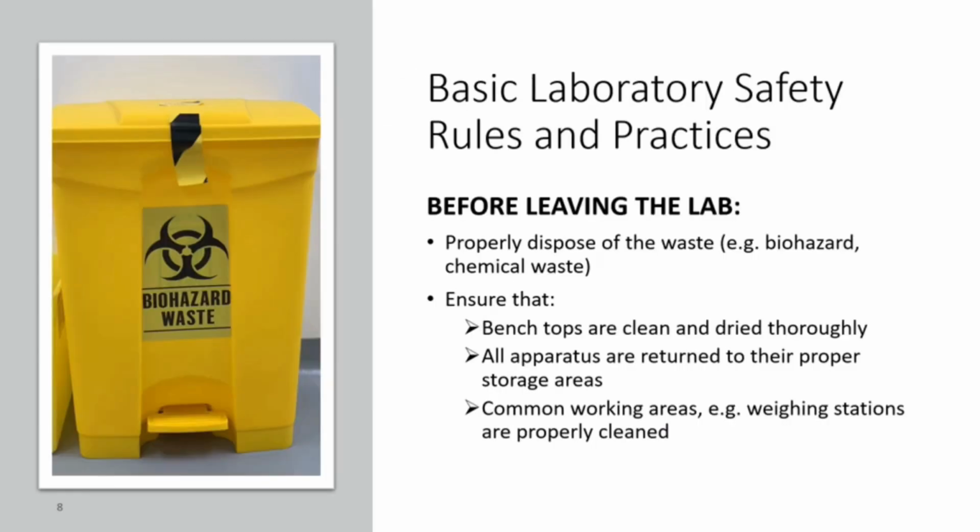Before leaving the lab, you should properly dispose of any waste into the designated place. For example, the biohazard materials should be disposed into the biohazard waste bin, as shown in the picture here. Chemical waste should be disposed into the designated chemical waste bottles instead of being poured into the sink.